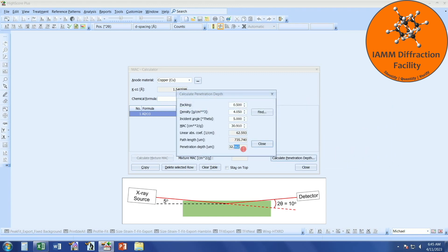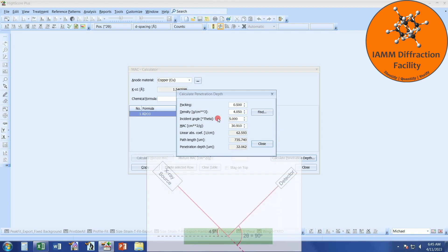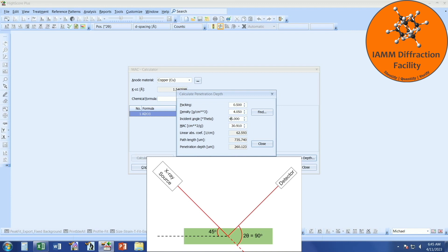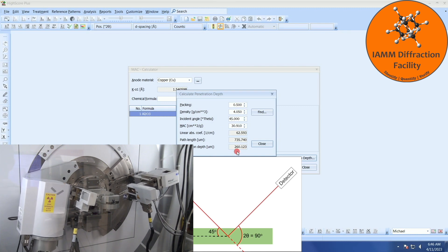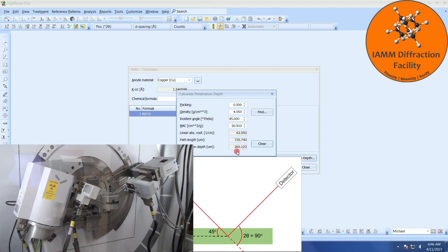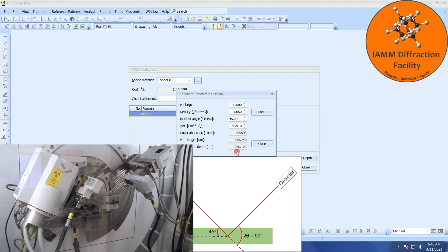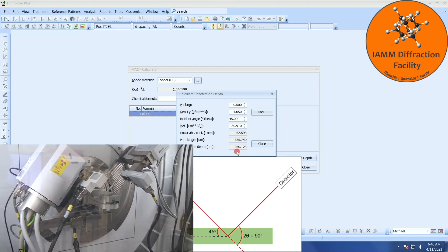And we see the penetration depth down here. We have 32 microns, which will be the shallowest since it is at the very beginning of our experiment. Let's see now what will happen at the end of our experiment. By the time we reach 90 degrees 2-theta, we have reached 45 degrees theta, and our penetration depth is 260 microns. The penetration depth will gradually change as the experiment continues from 32 microns to 260 microns.